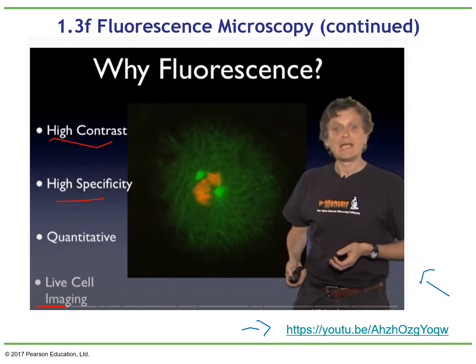Here you can see clearly the background is black, so you can clearly see that this is not a part of the cell. But you can also see that in the cytoplasm, you have something green. So here, let's put a C here. This will be the cytoplasm, and here will be the nucleus. And in the nucleus you can see, for example, the chromosomes.